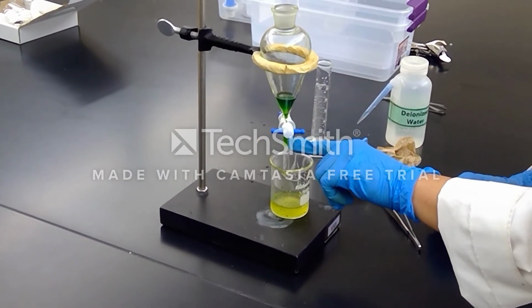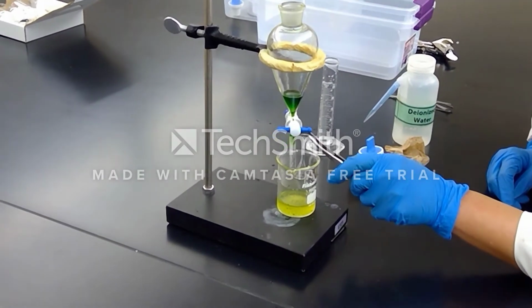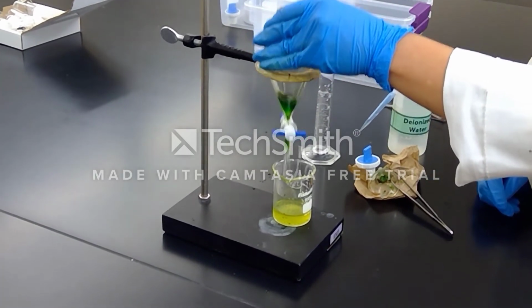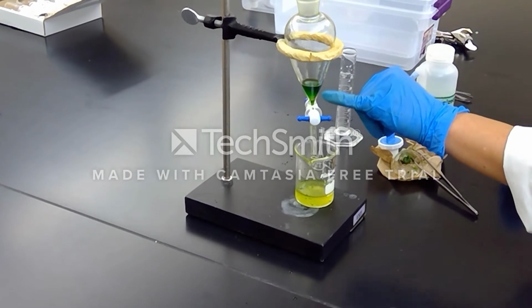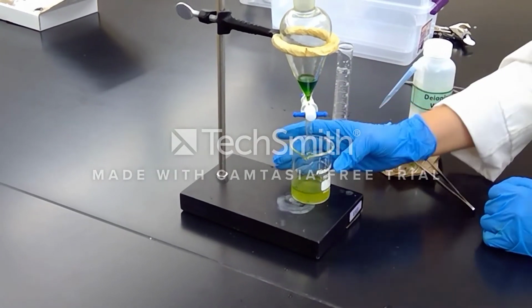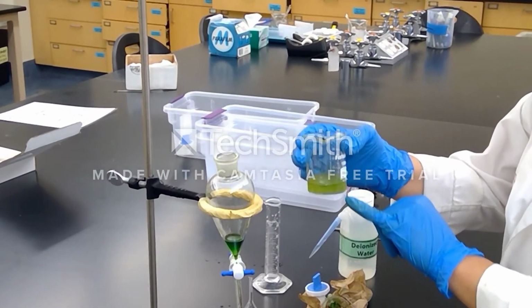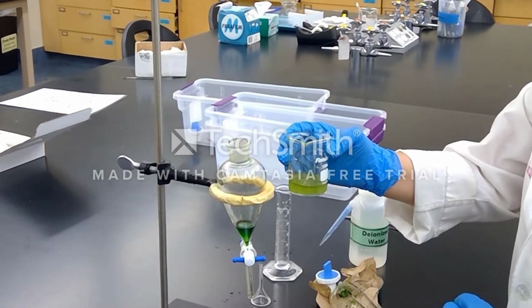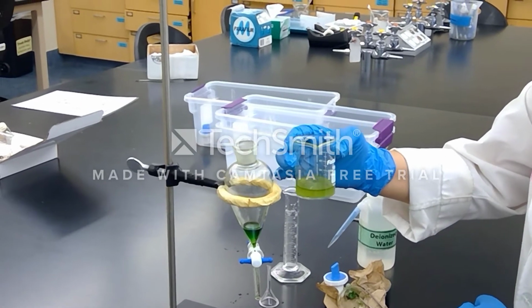I'm going to go ahead and let this little bit out, just because I did notice that it has a tiny little bit of a solid that managed to get through my funnel. So I'm going to go ahead and let that out. Now in my layer that I am keeping, I have only hexanes up in this upper layer with the nice dark green color. Down below, this is my aqueous layer, which contains water and whatever methanol was left over from when we were crushing the spinach in the mortar and pestle. And you see a couple of floating solids that managed to get through my funnel.